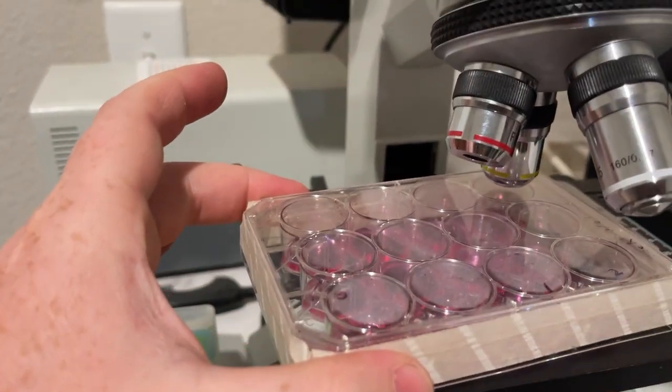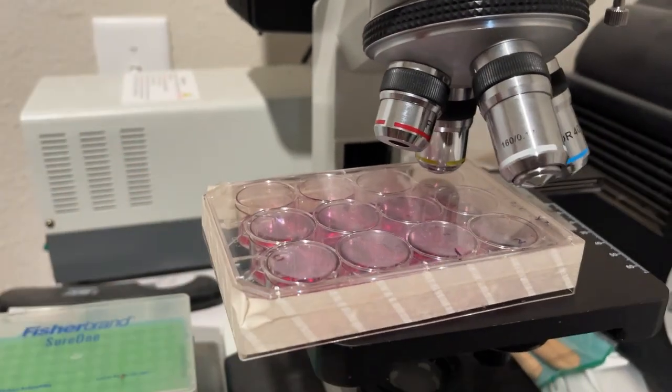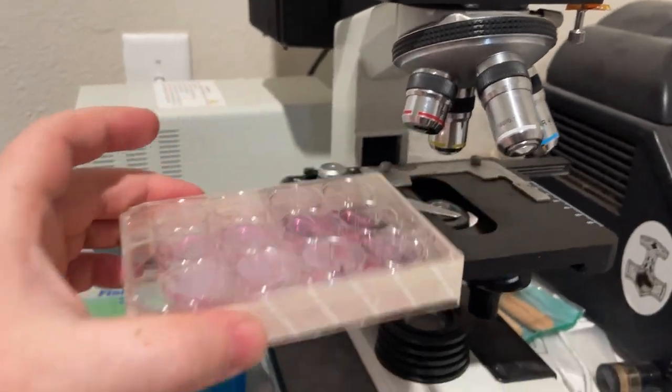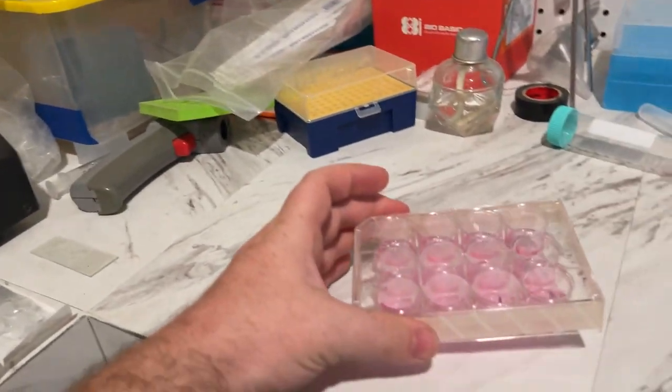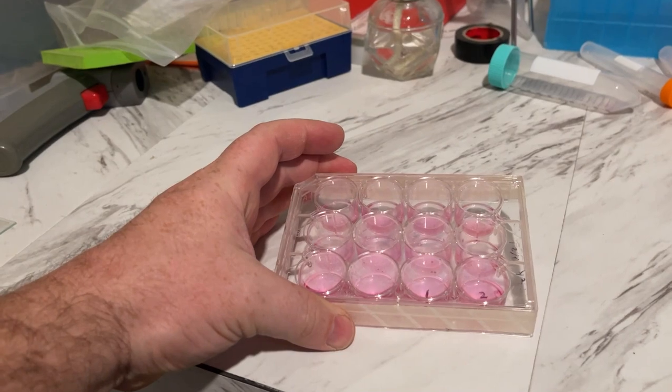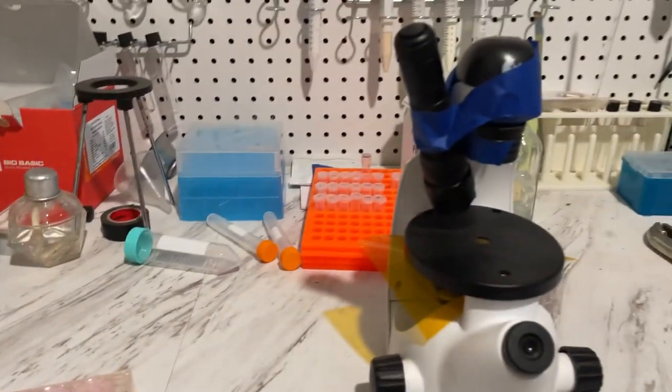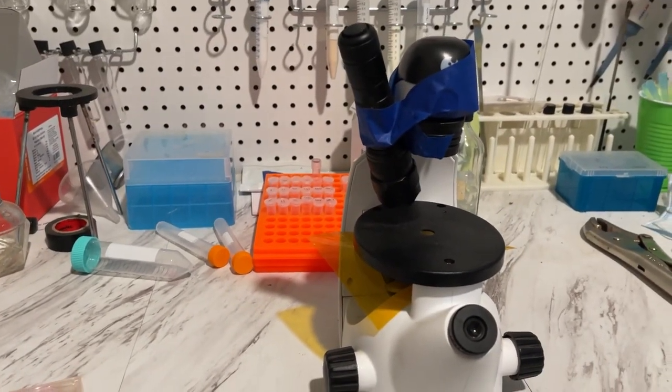The answer to not having an inverted fluorescent microscope is this. And crazily enough, it actually works. This is the fluorescent microscope. This is the sort of improvised fluorescent microscope here.